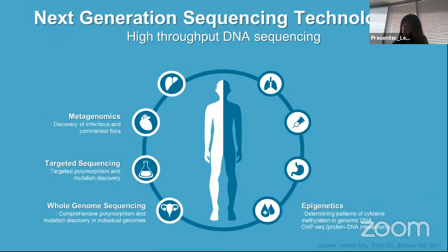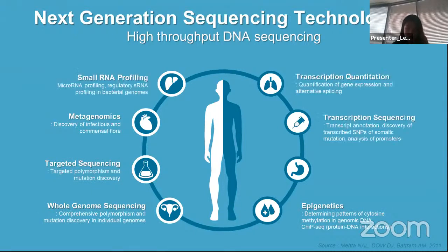As shown on the screen, NGS can be used to analyze DNA and RNA and even protein. It is used in various places, including personalized medicine implementation through genomic research, rapid and accurate diagnostic technique development, DNA profiling in forensic science, and analysis for uniform cell culture in industry.